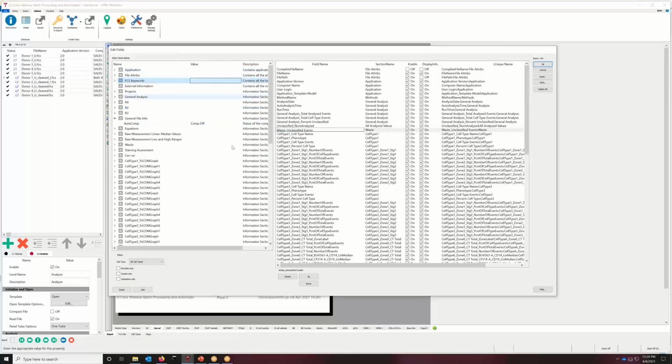This edit field system can also be sorted. You can sort by cell type, and you can sort by percents only, counts only, or intensities only, which makes it a little bit easier to find something. There's a lot of information available here. Currently, this is set up with 104 items, but I could easily go to hundreds of items for my database.